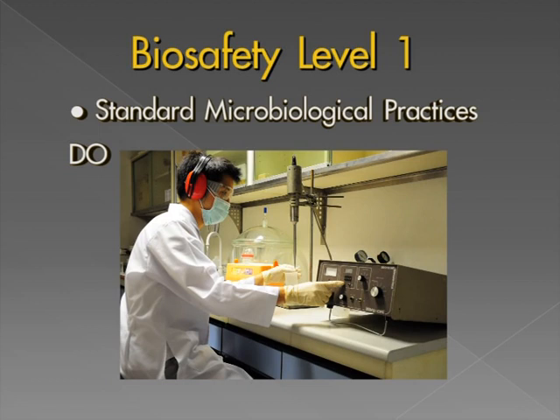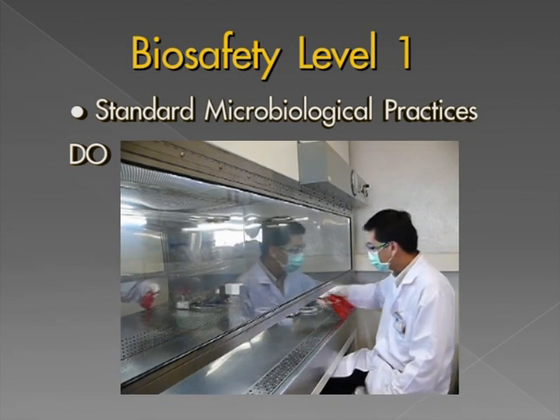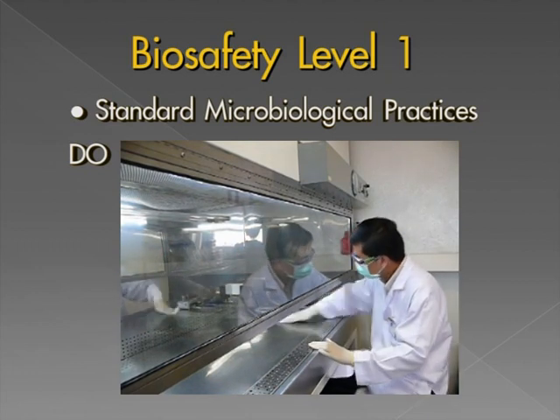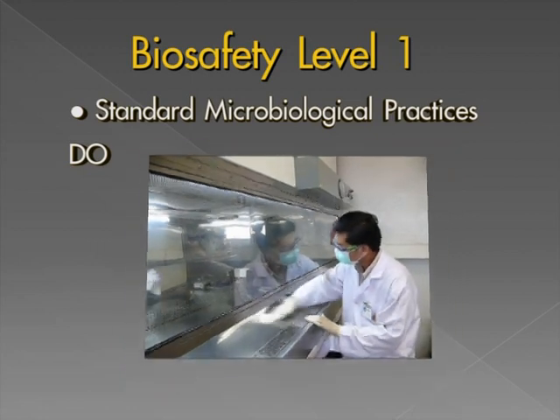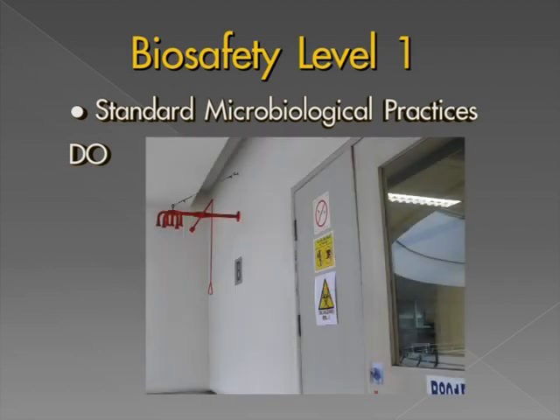Use eye and face protection to minimize the chance of facial contamination via splashes or aerosols. Decontaminate work surfaces before and after completion of work, as well as after any spill of potentially infectious material with an appropriate disinfectant. A sign incorporating the universal biohazard symbol must be posted at the entrance to the laboratory where infectious agents are present.